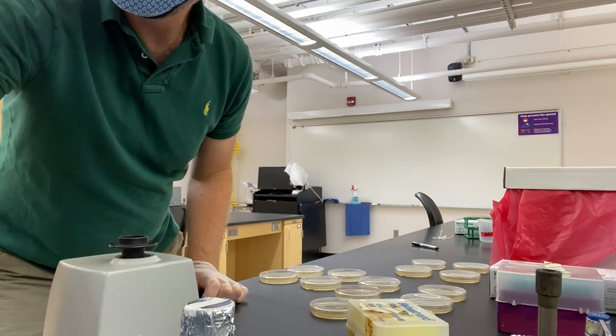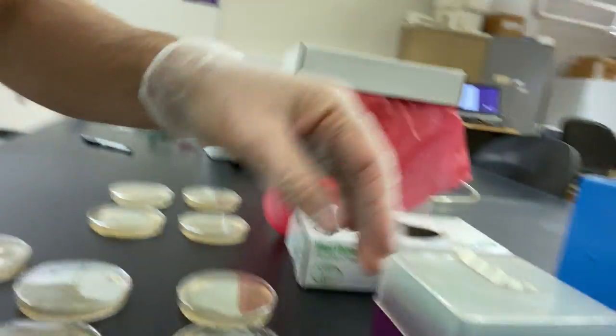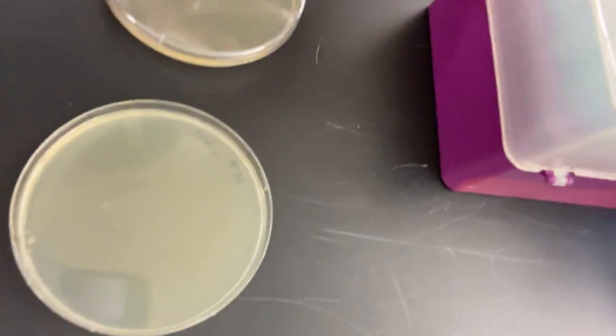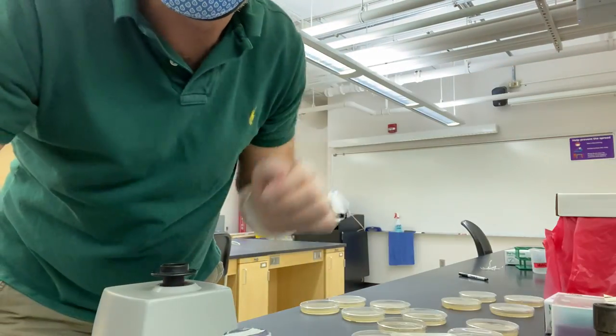I've got a little ball of liquid on each of these petri dishes. Let me show you what I've got here so you can kind of see it on there. I'm going to smear that around with the spreader, so let me start a new video for that.